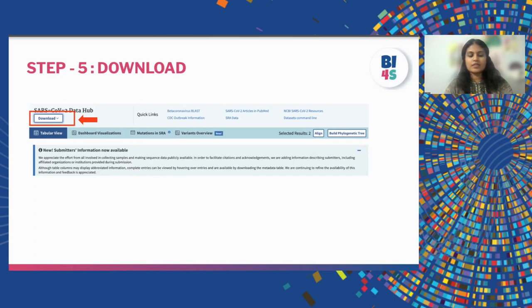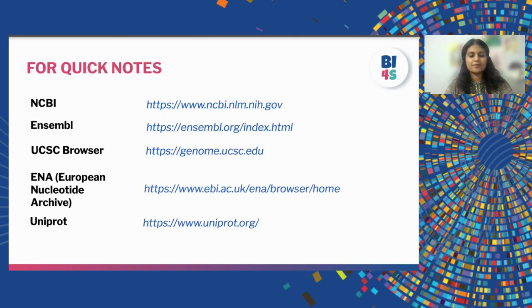So this is how we are going to access a virus sequence, or in other words, retrieve a virus sequence from a database.